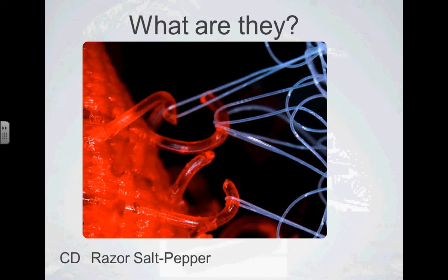What? Jelly. Jello? No? Is it edible? No. You may have this on your jacket in your locker. Zipper? Is it Velcro? Velcro. Velcro works by, you know the rough side of the Velcro? That's a bunch of these plastic little hooks. You see the hooks. The softer side is this sort of weave of loops of fabric. When you push them together, the hooks kind of grasp on to the loops, and it stays together. When you pull it apart, these hooks are kind of flexible. So as you pull it apart, those hooks flex, the loops detach, and then you can separate.